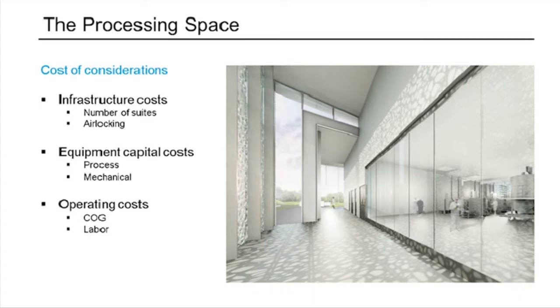But it's important to note that that one-to-one cost is not necessarily an equivalent representation, because the true cost of an open operation really should include things like the operational footprint. You might have a larger footprint required to do that operation because it's so manual.